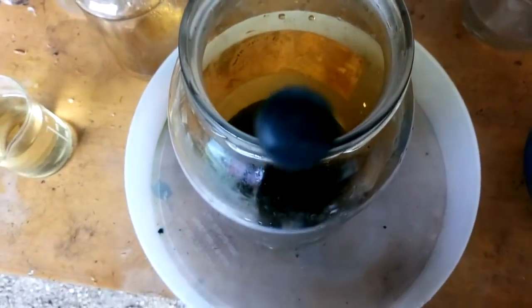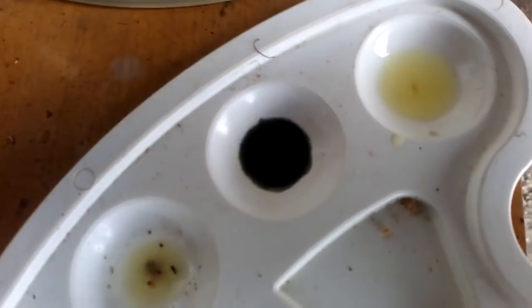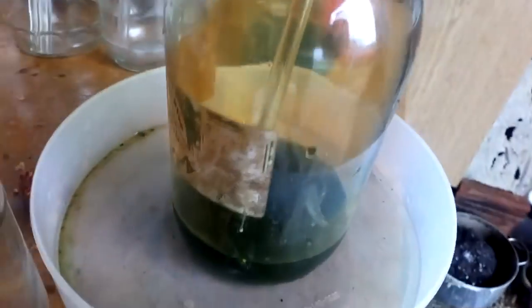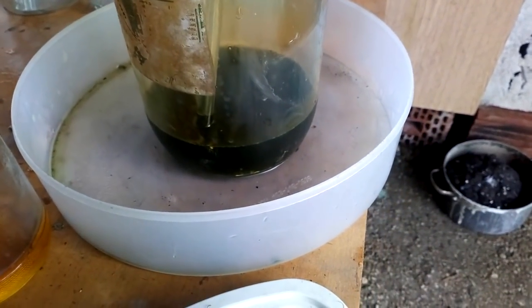Now we're gonna drop that. It's on a stannous test and it's pretty positive. Very cool. So now we're gonna filter this, neutralize with urea, and drop some gold.